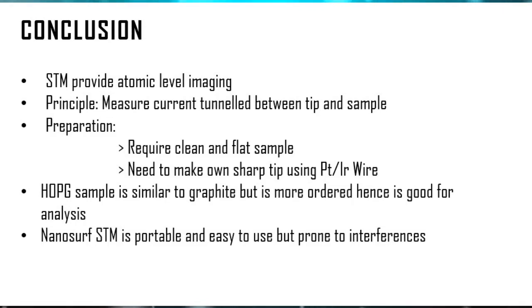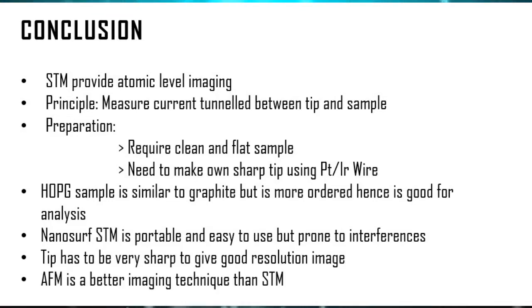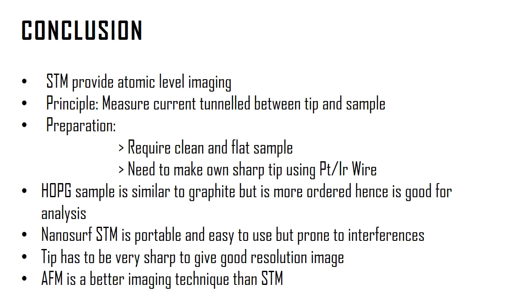However, it is good for teaching purposes. The image taken by us proved that the tip has to be very sharp in order to produce image with good resolution. And lastly, other than STM, another imaging method could be AFM, which should be able to give better image.